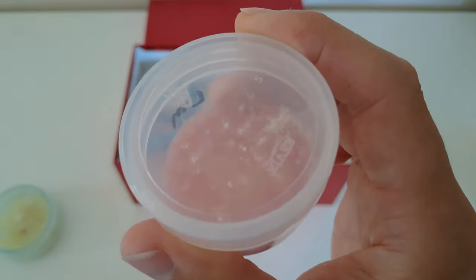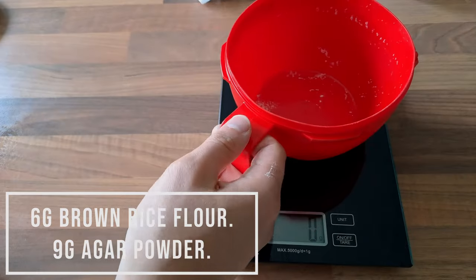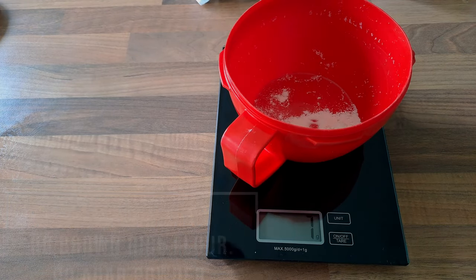Let's get started. First thing you've got to do is weigh out 6 grams of brown rice flour and 9 grams of agar into a mixing bowl.